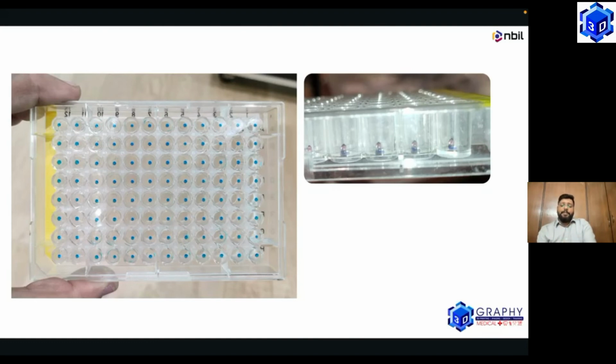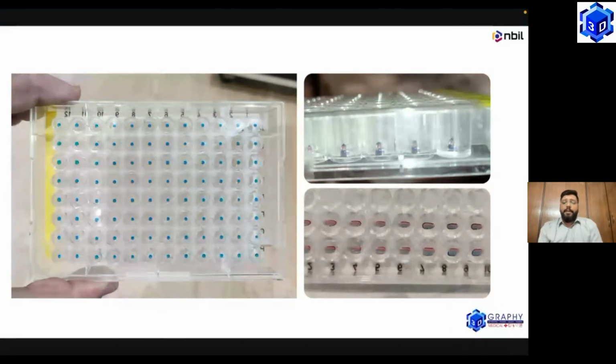Now that they saw this, they said, okay, we are doing another form of co-culture studies where we wanted to print one line beside another line. Now imagine printing this in a very, very tiny well. You would appreciate from this picture that the well is extremely small. It's close to around 0.5 centimeters, if I'm not wrong, or even lower.